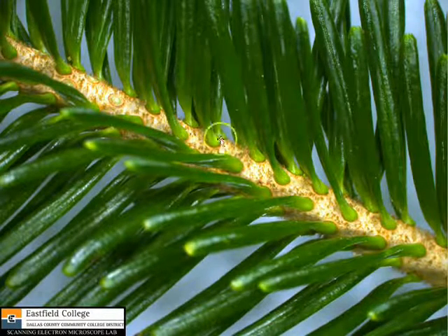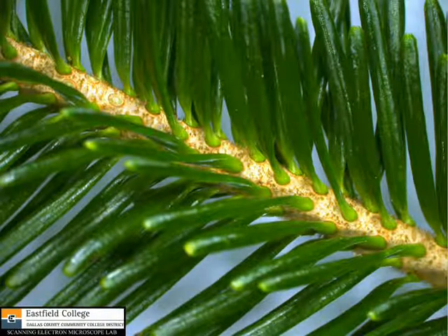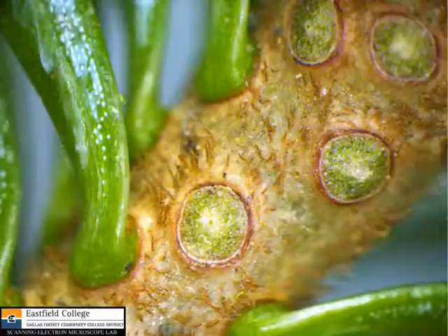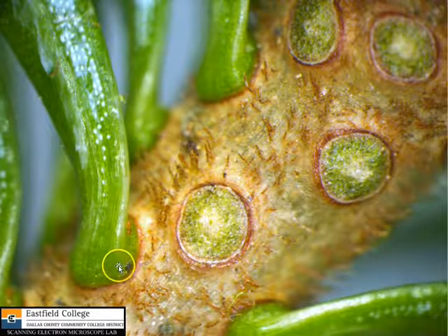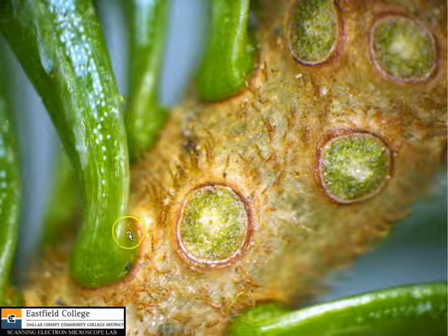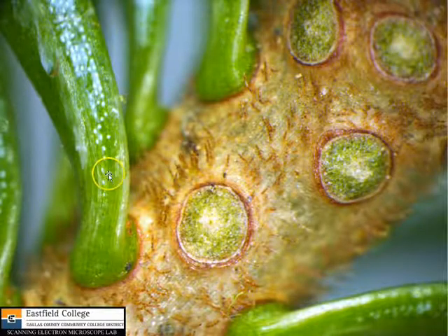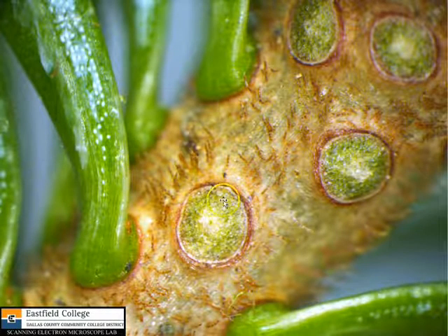And what you can see is the leaves coming off the stem, and you can see where some of the needles have actually fallen off the stem, which is kind of cool. Here's a closer look at the needles that are on the stem, and you can even see some sap from the pine tree here on the base of the leaf. And this is where a leaf was attached, or a needle.